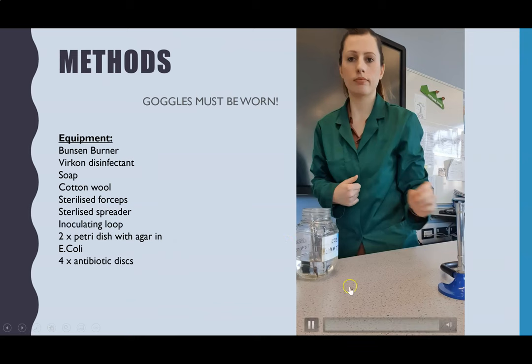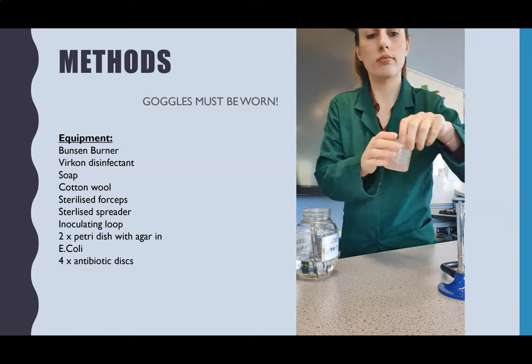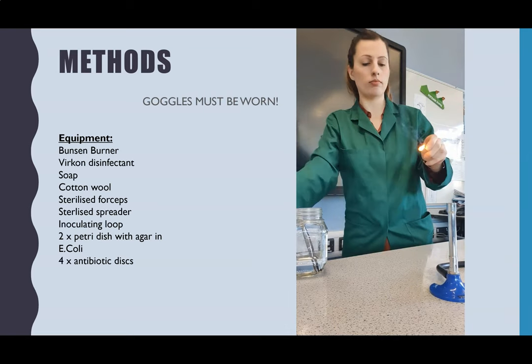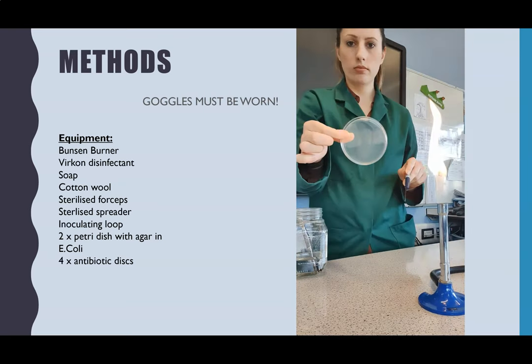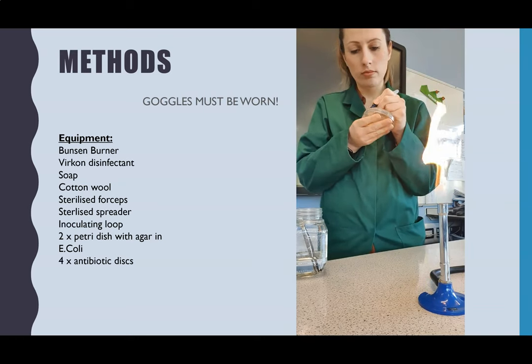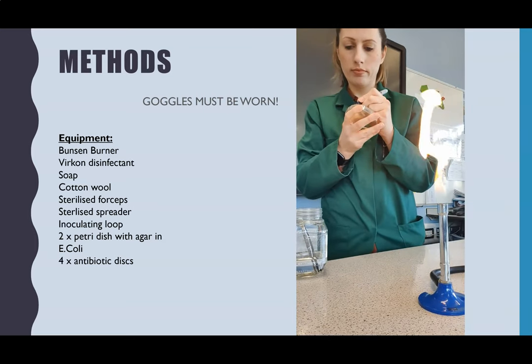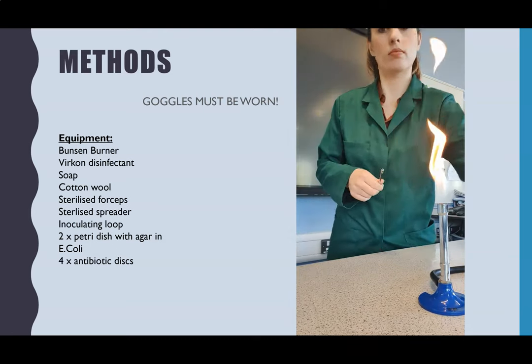I've got an equipment list here and we can have a look at the experiment at the same time. I've washed my hands with soap, then sterilised the surface with Vercon, and got the Bunsen burner on to a roaring flame. Now everything is sterile, I'm going to label the two Petri dishes first. It's essential to label them with your initials, the date, and the contents — so that if the plates are found by someone else they know exactly what's in there and how long it's been growing. That is a serious safety consideration.